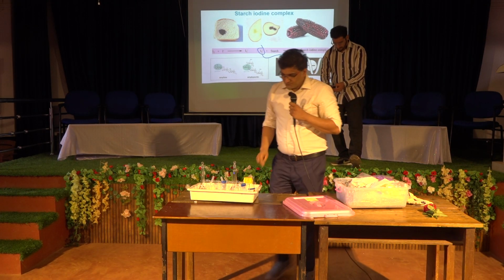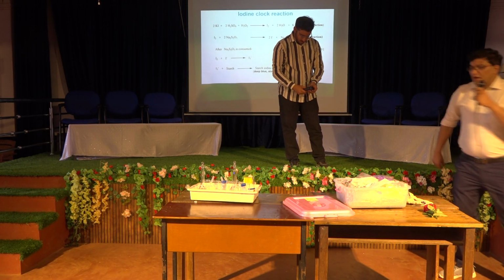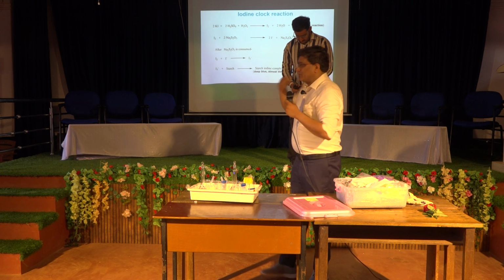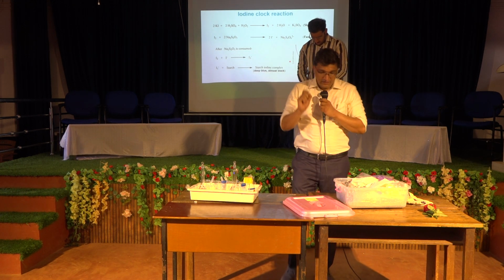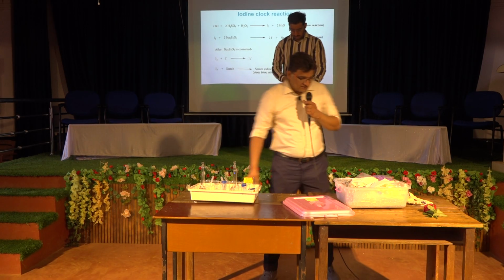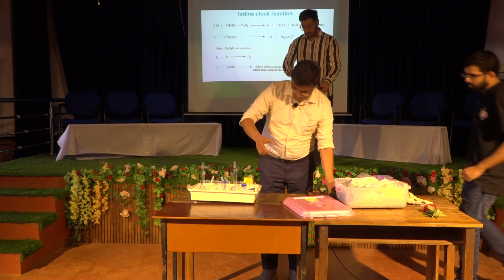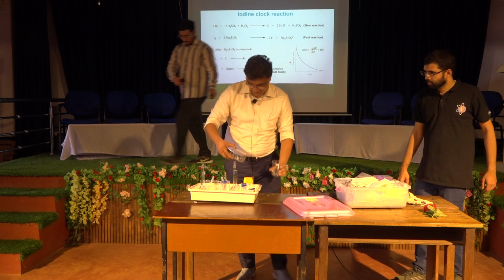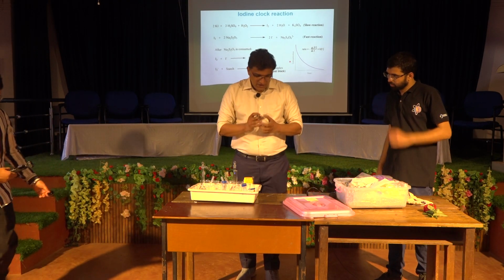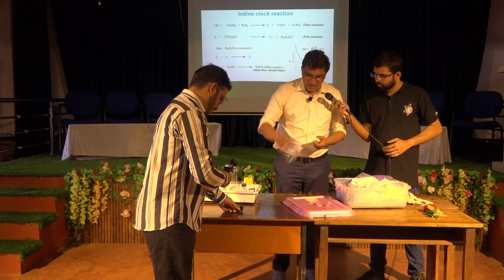Okay. So one of the experiments that we do is called the iodine clock experiment. You can track this complex formation by monitoring iodine concentration in terms of time. So let me start that. I have 5 solutions.